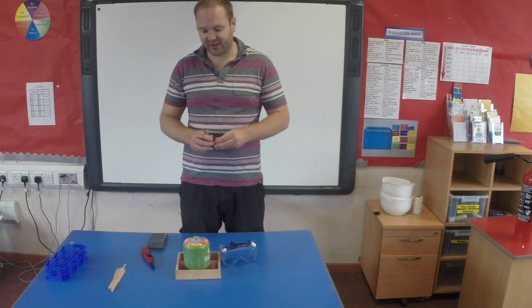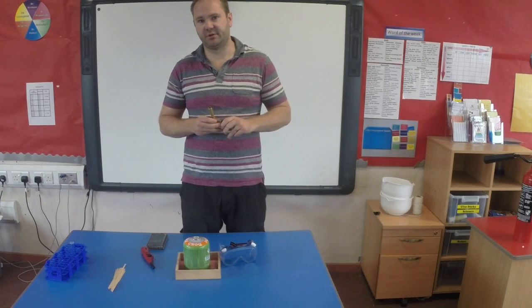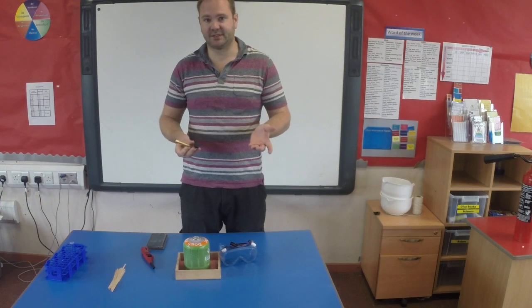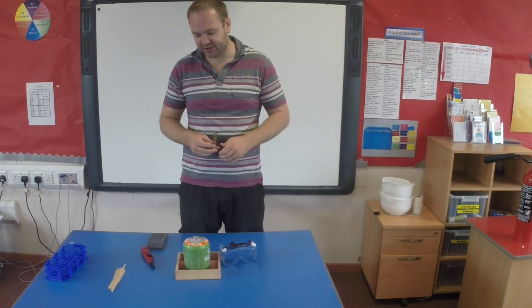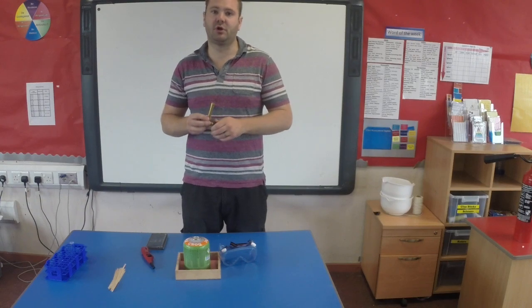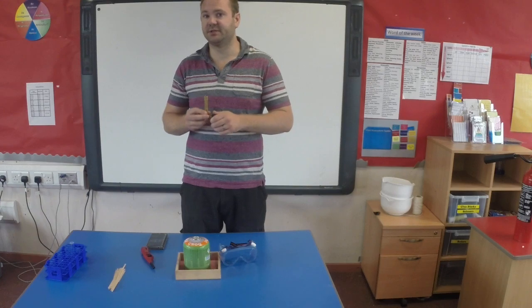Safety is paramount with this. Anytime you're lighting any sort of fire in the classroom, it's really important that it's done safely. It's a good idea to know where your fire extinguisher is in case there is something that needs controlled. You should always be able to shut off the gas mixture as well. That's really, really important. If you follow correct procedures, the risk of anything going wrong is minimal.